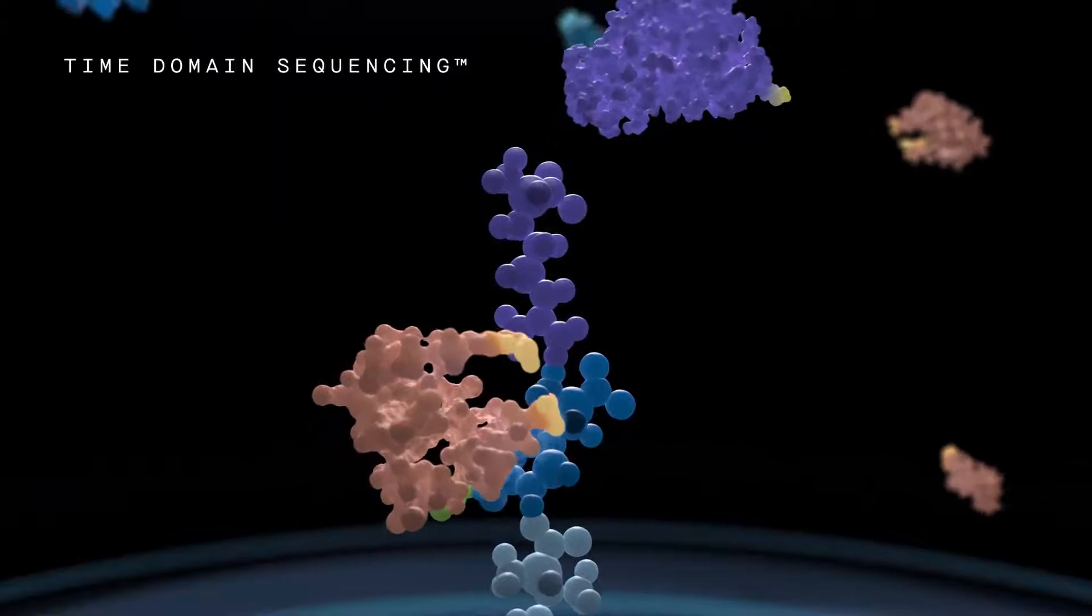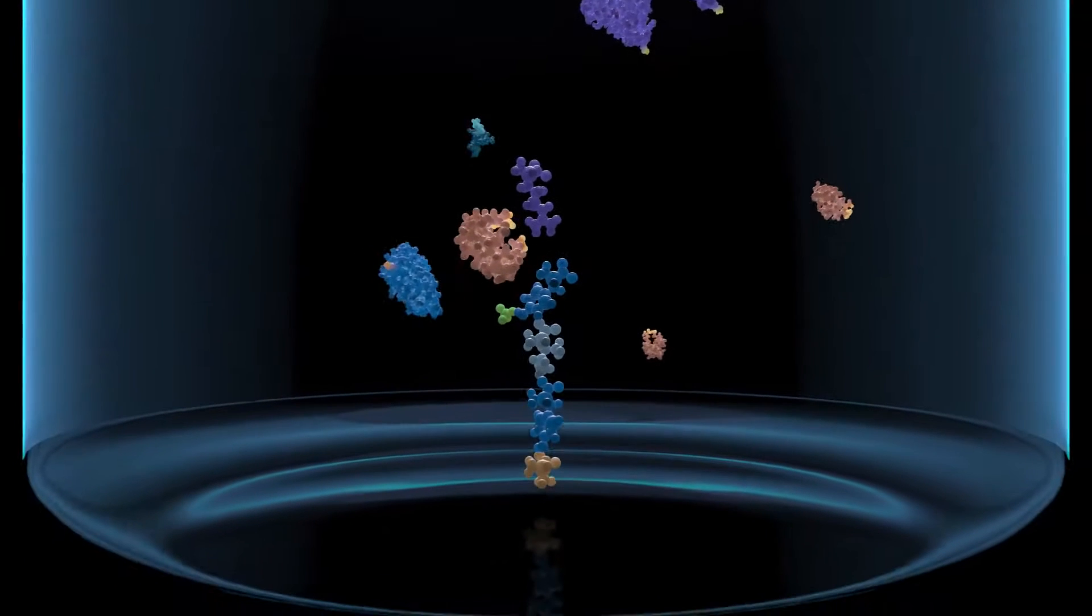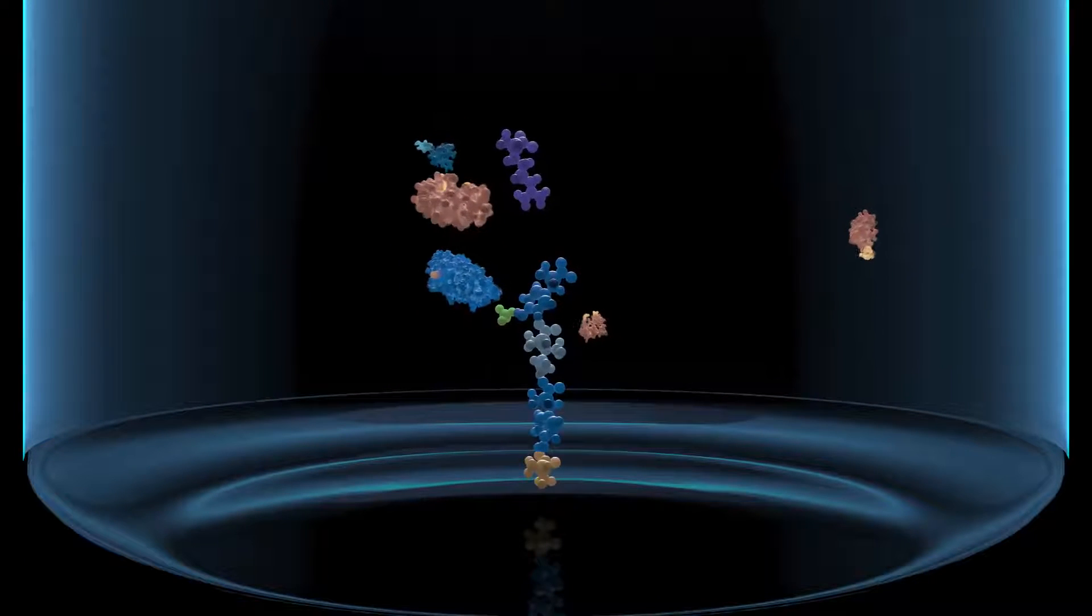After many binding events of the recognizer, another molecule called a cutter removes the terminal amino acid, exposing the next amino acid in line.